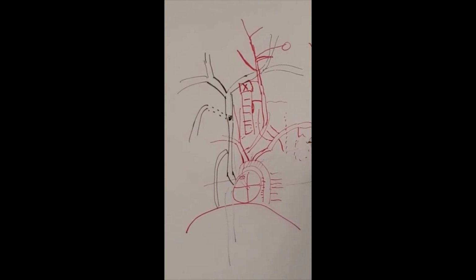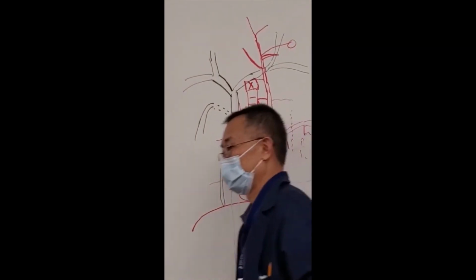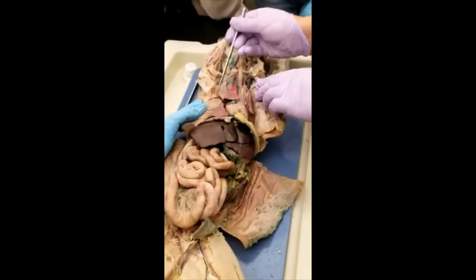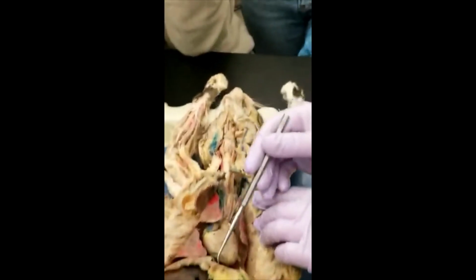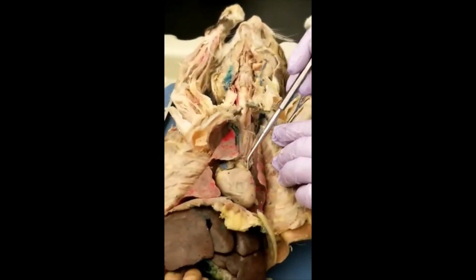Same. Okay? So that's for the artery and the vein. Everybody's ready? Okay. So this is diaphragm. Alright? So this is heart.